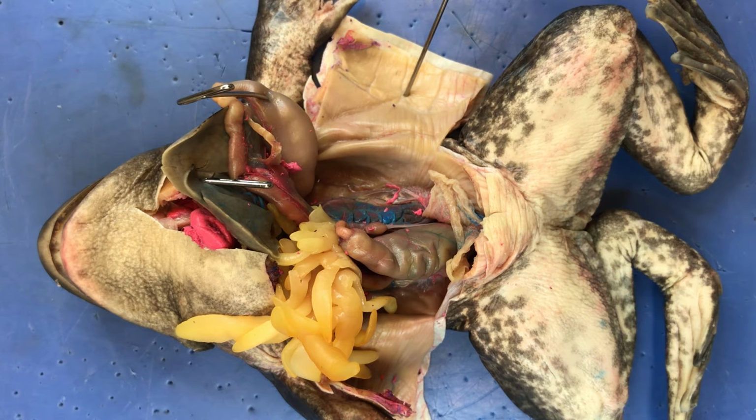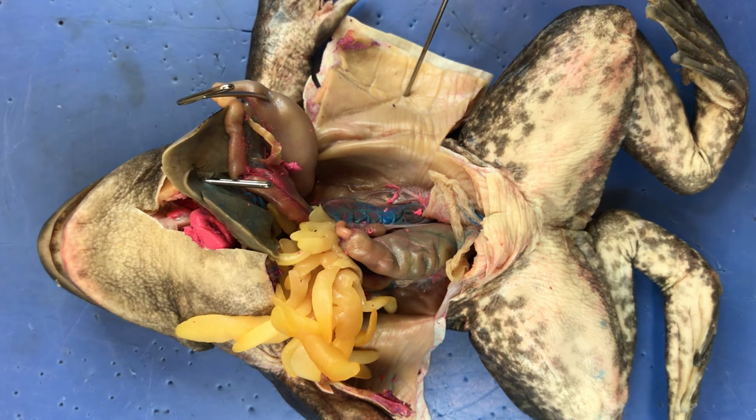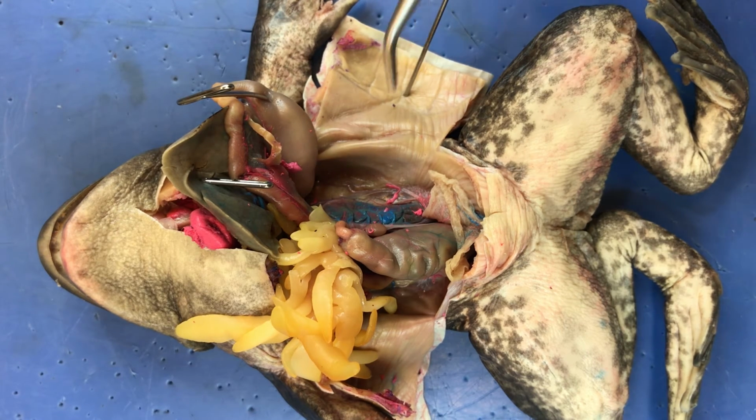The reproductive system of the male consists of paired testes. The left testis is seen here and produces sperm. That sperm travels through the anterior portion of the kidney and also enters the urinary duct and passes through a seminal vesicle, which is not visible here, and into the cloaca, where it then exits through the vent.